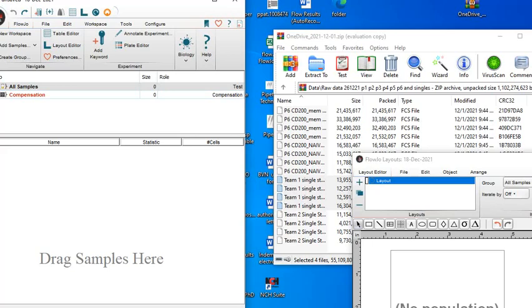On this series, we'll be looking at using the Flowjo. Many of us would want to run analysis using flow cytometric means to detect cells, all kinds of cells, most especially the immunological cells, to see how the immune system will respond to foreign antigens, and also possibly to look at immunological markers, and also the response of cancer cells. Anybody who's working on cell lines will most definitely use flow cytometric analysis.